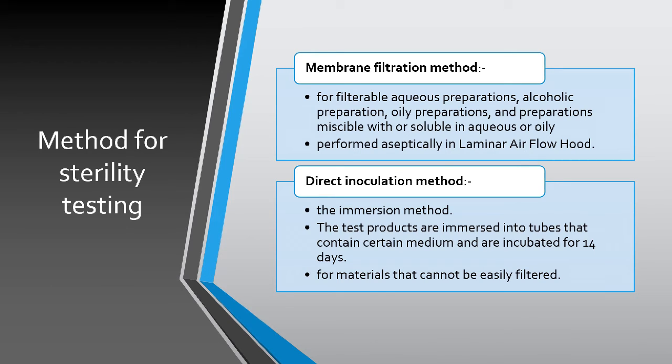For the method of sterility testing, there are two methods. The first one is the membrane filtration method. Membrane filtration is appropriate for filterable aqueous preparations, alcoholic preparations, oily preparations, and preparations miscible with or soluble in aqueous or oily solvents. This method is performed aseptically in a laminar airflow hood. The second method for sterility testing is the direct inoculation method, which is also called the immersion method. The test products are immersed into tubes that contain a certain medium and are incubated for 14 days. This method is appropriate for materials that cannot be easily filtered.